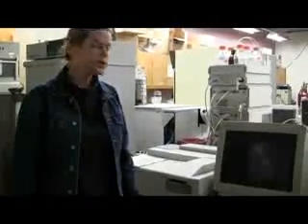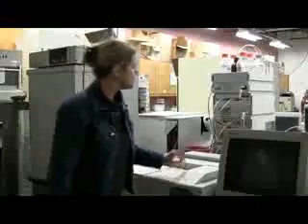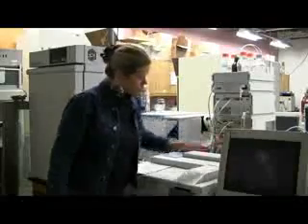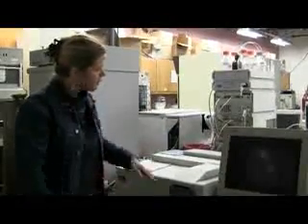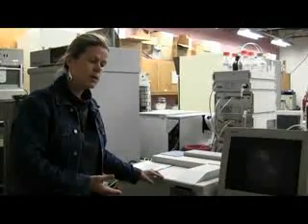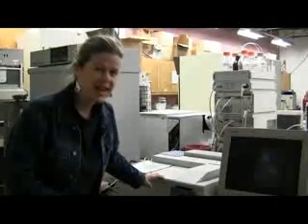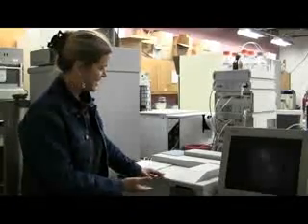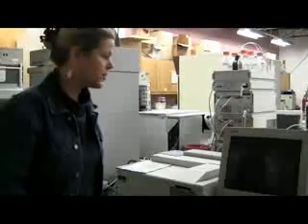So the first thing we're going to do is turn on the spectrophotometer, which we will do by pressing the on button, the green button back here. And you know that it's setting itself up because it's going to make a set of clicking sounds. Can you hear that? Okay, we are good. Next, we will turn on the computer.